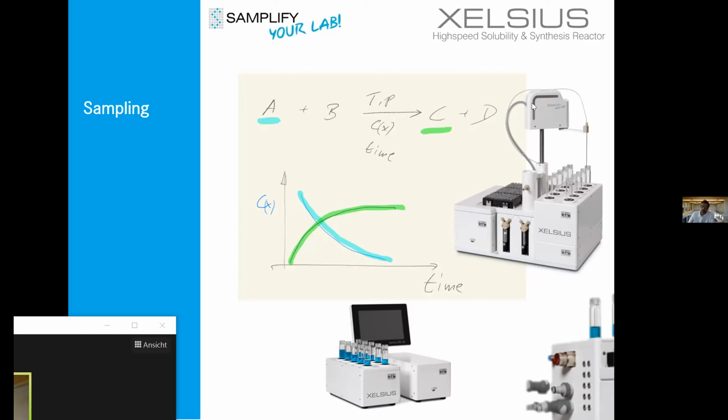And for this, you see, we have the components, and also the concentration and time is important. And so sampling is the time when you take the sample is important for your reaction kinetics. And also important is the concentration and the dilution later on.